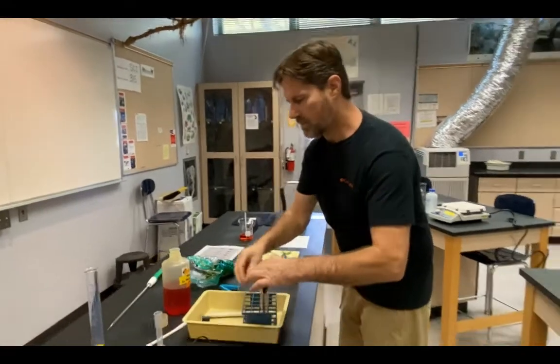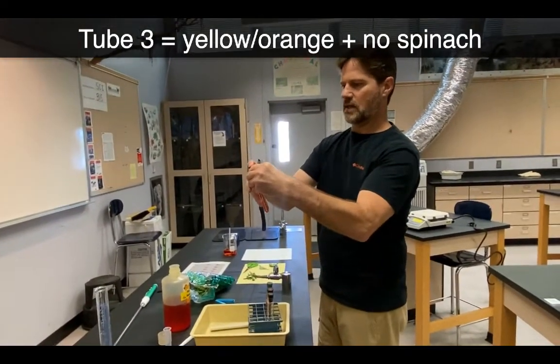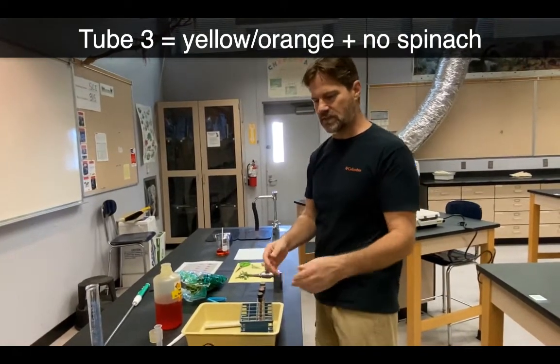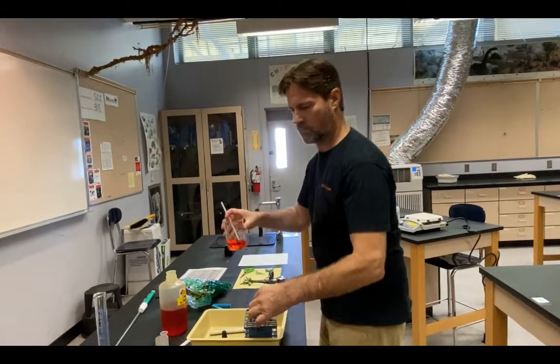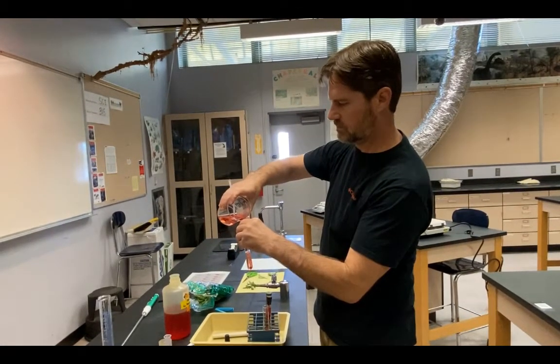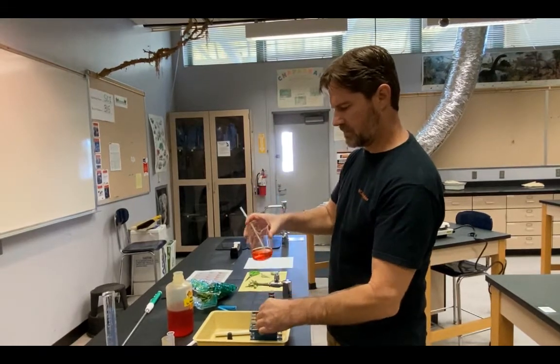Now test tube number 3 is simply going to receive that slightly yellow phenol red. I do need to also add that to test tubes 1 and 2. I may not top those off just yet.